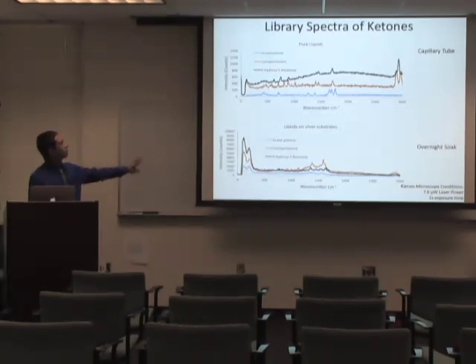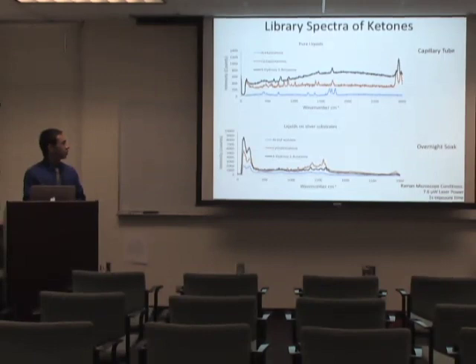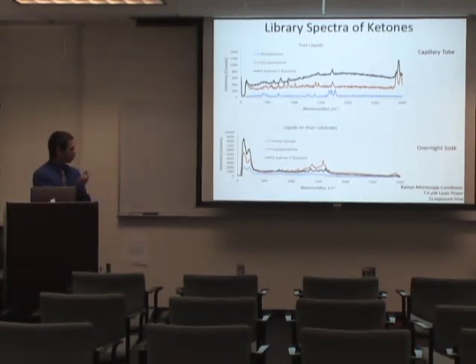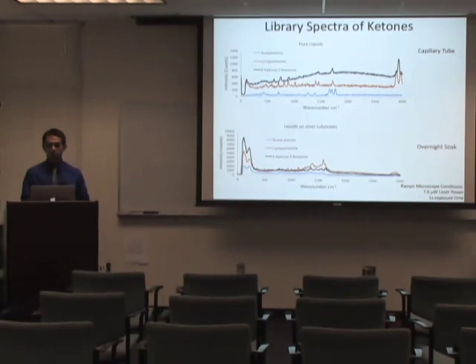As you can see, there are differences between both of these graphs, but this is normal because the bottom ones are actually in an environment of the silver. The silver is what causes these relevant shifts to create these different peaks. And on the top one, you see that there is no environmental influence in it. So those are relatively just pure liquids, and these are the ones that are changed because of the environment.